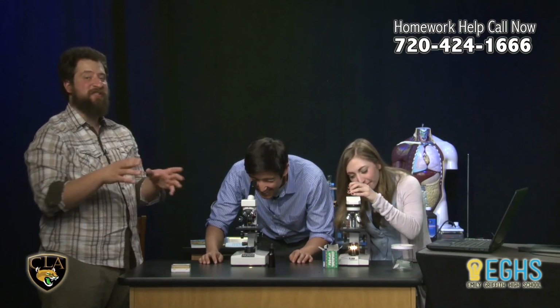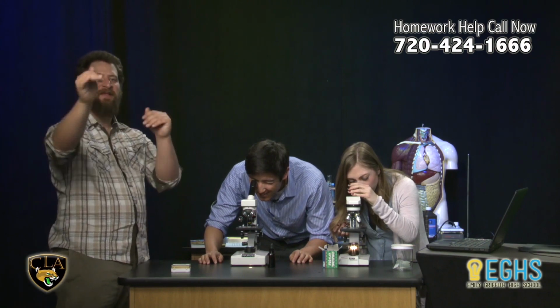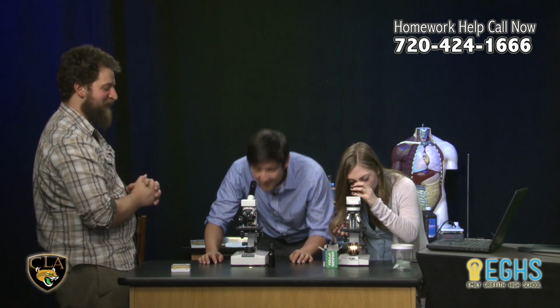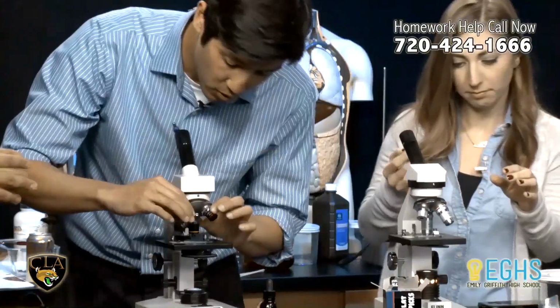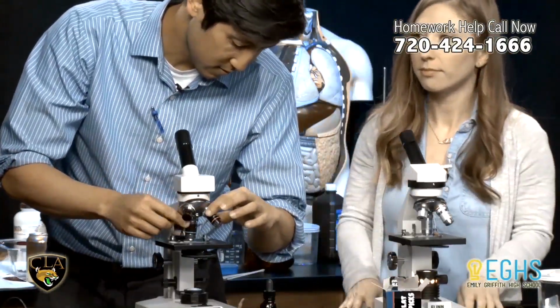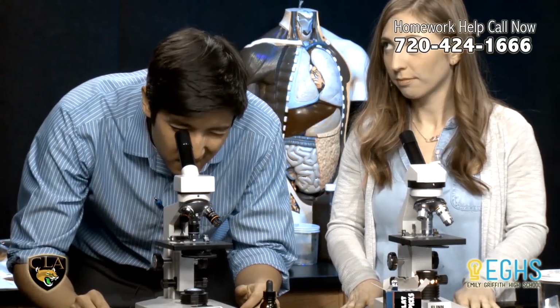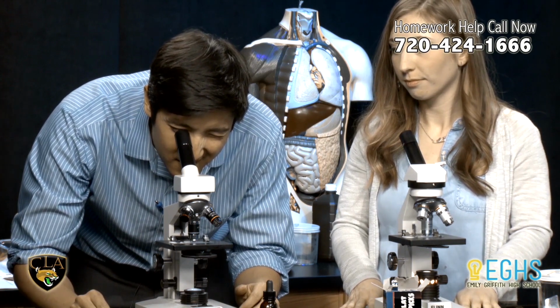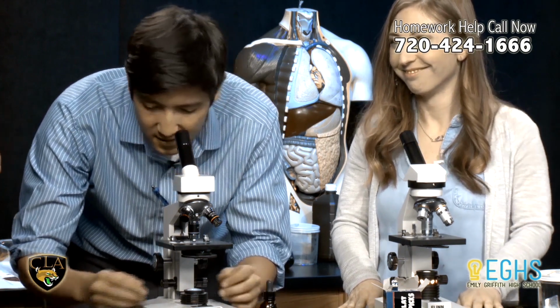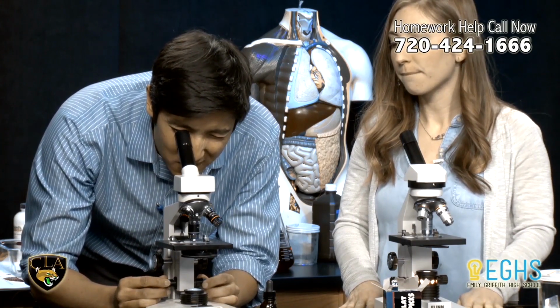So Nate, take a look at that. We're just at 100 times power, so we're going to bump it up to 400 times power, take a couple pictures, send them, see them, and then get back to the normal thing. So Nate, bump up to 400 times. One more clockwise turn. We're going to bring that into focus. Can you still see that guy there? Can you see the nucleus? Yeah, really, this is a good cell. Do you need to use the fine focus at all to bring it slightly more into focus? Yeah. Eyelashes are getting in the way.